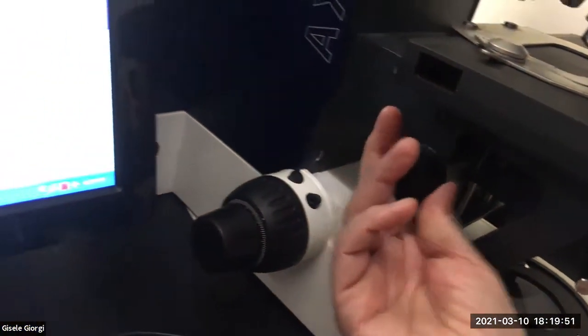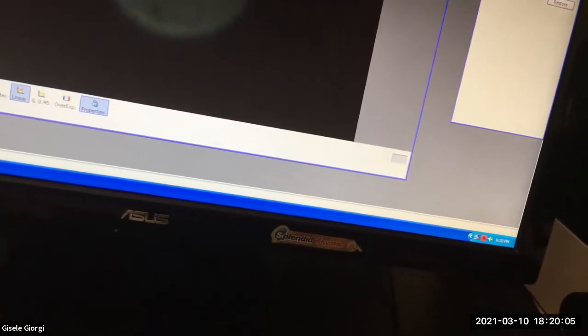Remember this big blurry circle before? Here, let me do it again. So I'm gonna move it so that it's out of whack and it's blurry and then it's totally far gone. Oh my God, the light is horrible. I'm starting to see dirt in different parts of the scope there, actually, possibly. Let me see if I move it. Yeah, so anyway, the light is so out of whack that I'm just seeing random stuff show up.